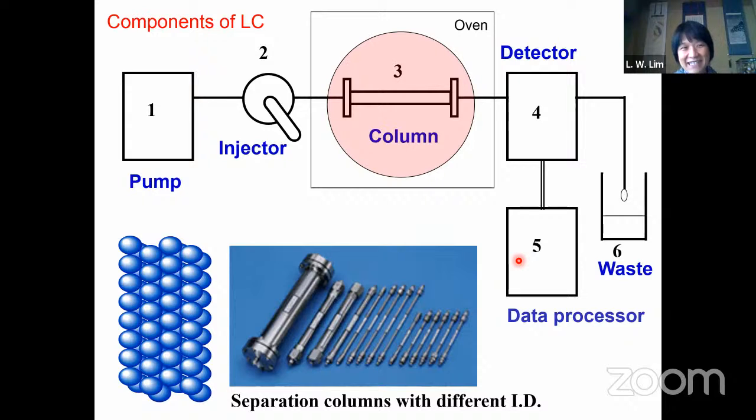Sometimes they say you can use 2-channel, but if the 2-channel is not individual, that means you have to connect them together. You cannot separate them and use them for 2 different systems. It is also meaningless. So when you ask for the software, if you want to use it for 2 systems, especially when you have a lot of students and want to use it for 2 students, then you have to ask for 2 independent channels. Anyway, this is for data processors.